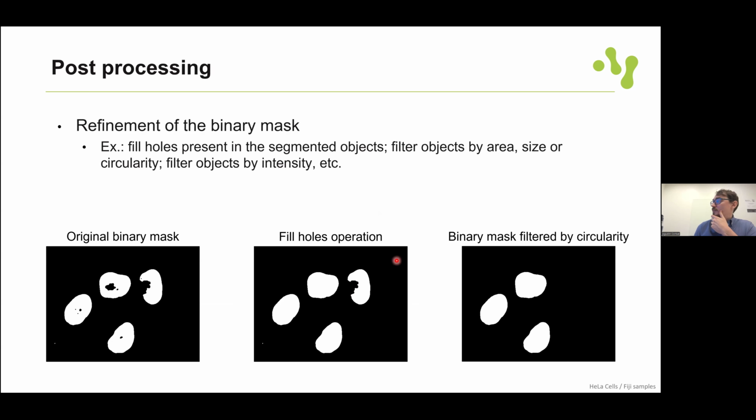Oh, this might be an interesting example for that. You could go very far with dilating this object so that you finally fill in this hole here and then erode it again. But you have to be really careful, because if you do that too many times, everything will end up being the structuring element you used. So if you were using a circle here and you dilate everything a lot and then erode it a lot, you end up with things that are just circles or perfect ellipses.